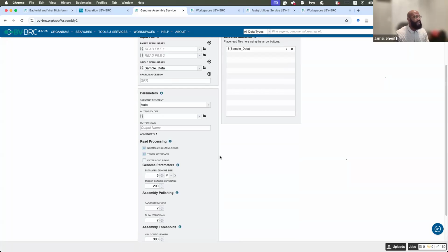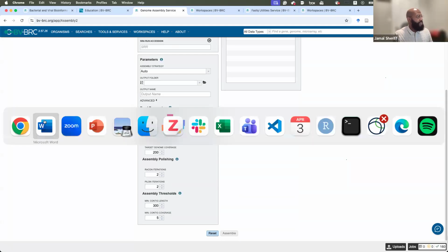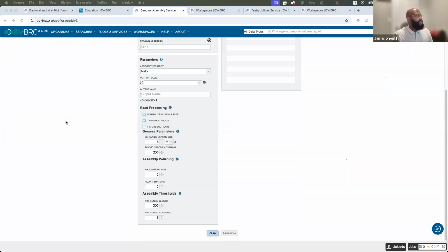But at this point, you've already done all your other parameters. Your assemble button should pop up. You can click assemble and wait for your job to finish. I'll give you 1 minute. If there are any questions, anything you need me to show again or walk through, I'm happy to do so.